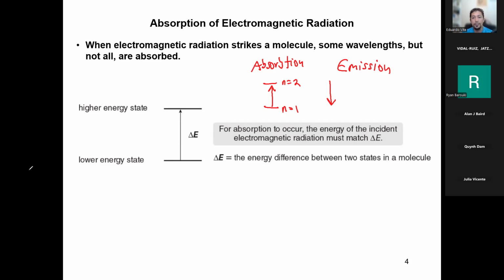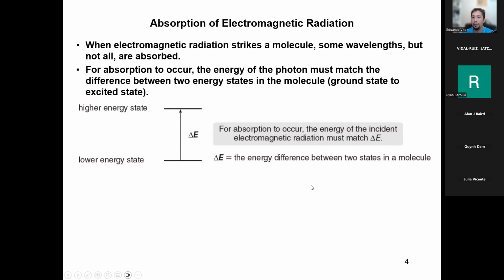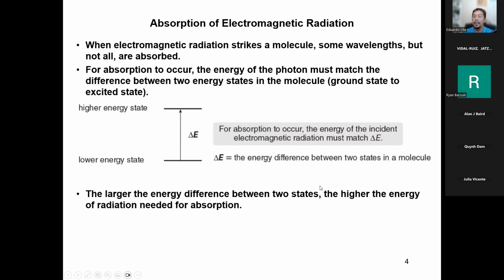So it's unique, is what I'm trying to say. All of these absorptions are unique depending on the type of the molecule. And they are unique because it takes a very specific amount of energy, no less and no more. Only that amount of energy will cause that action to happen.